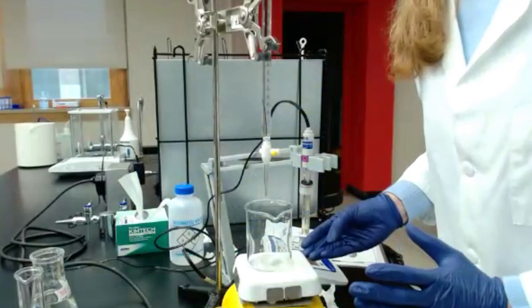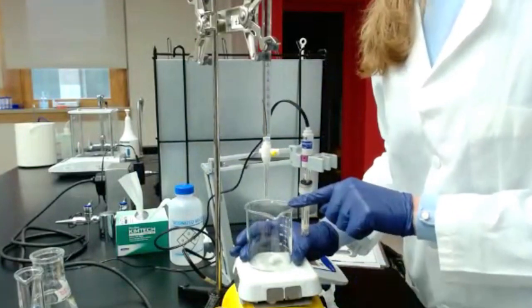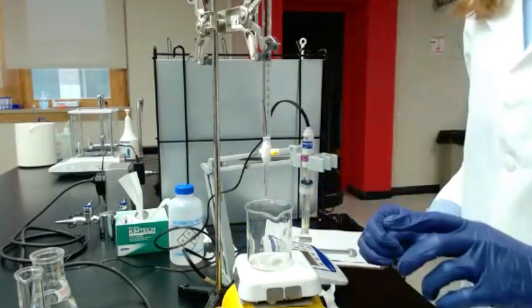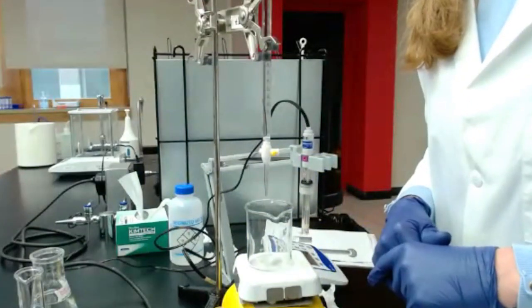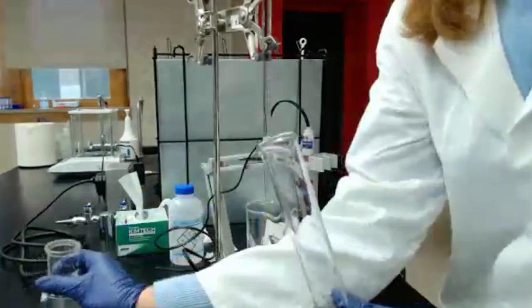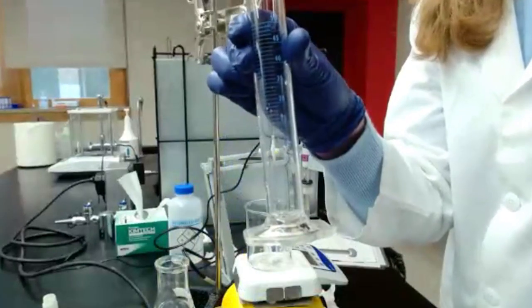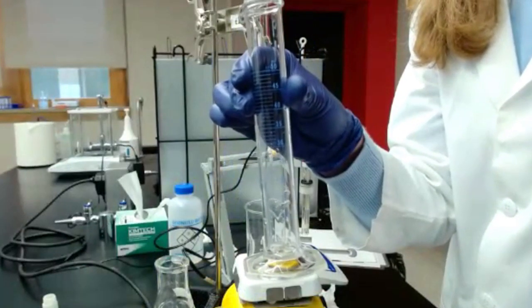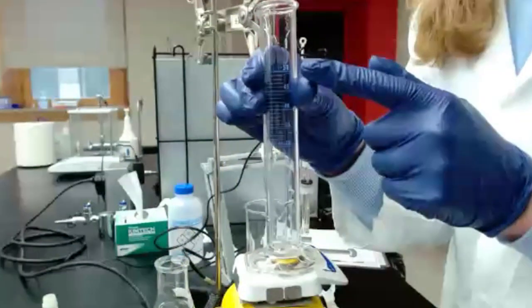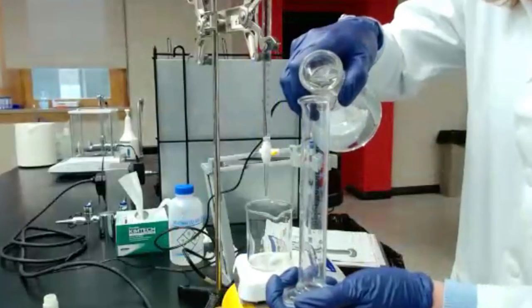It doesn't have to be big. So on the stir plate, you put the beaker and the stir bar. In that beaker, you're gonna use 100 milliliters of DI water. To do so, you can use a graduated cylinder. Here, that's a graduated cylinder of 50 milliliter max, so I'm gonna do it twice to get 100. And so I'm gonna pour.